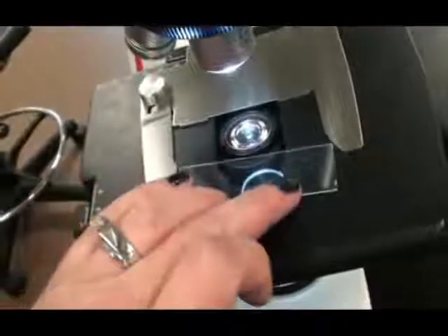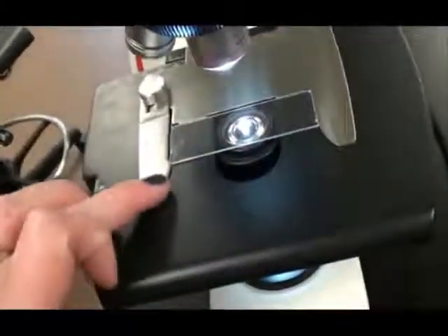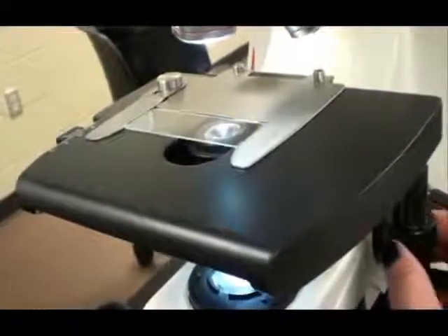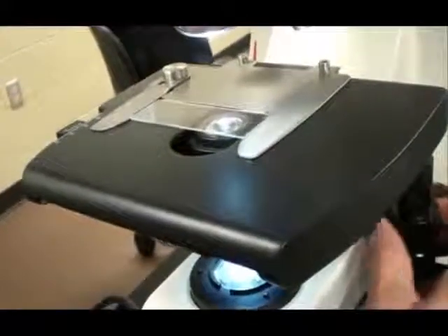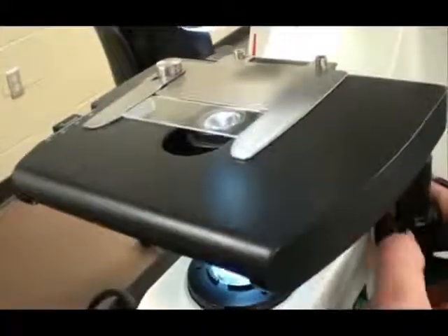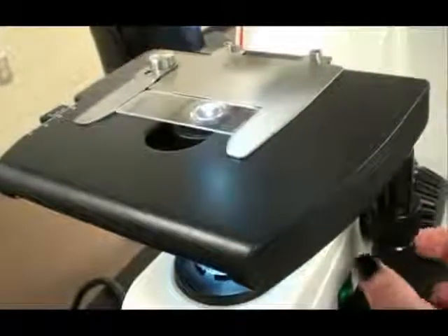A mechanical stage is a very handy feature to have on your scope. You can place your slide into the slide holder, and then adjust the position of your slide using the coaxial adjustment knobs, usually hanging off the side of the stage. This way you can center your specimen very easily.